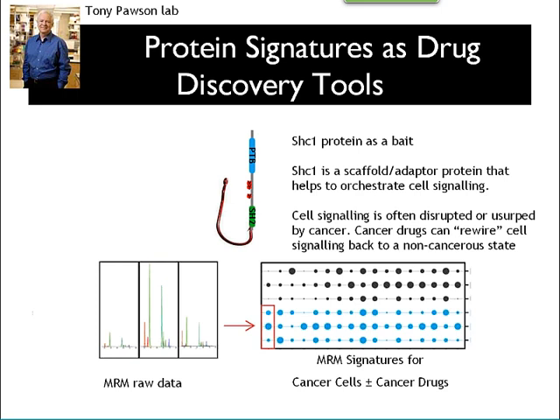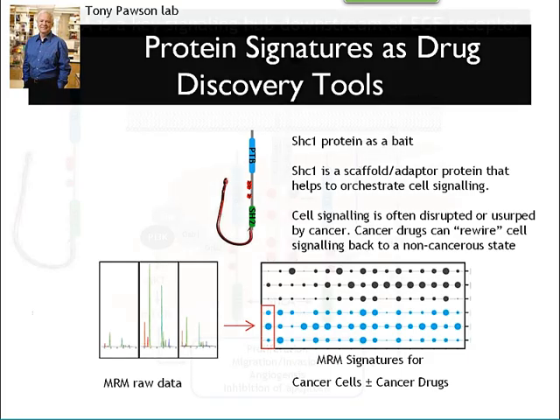And then because we're measuring so many signals, not just a single drug, but we're measuring many, many peptides at many, many proteins, we've tried very carefully to figure out what is the best way to represent these data so that it makes sense to people who don't want to get into the incredible amount of information that such an assay actually gives you.